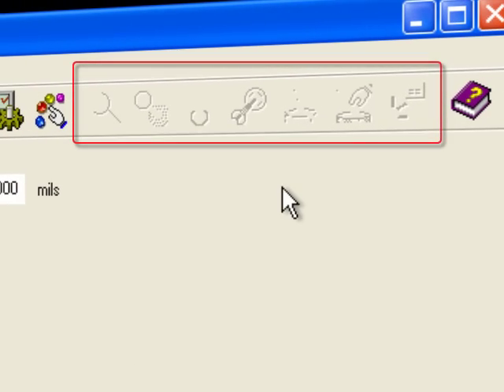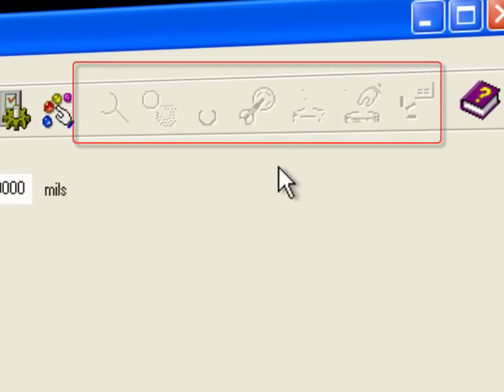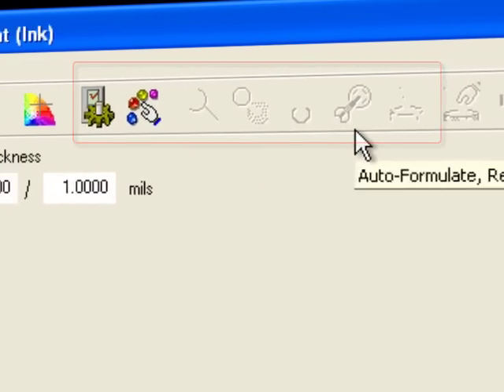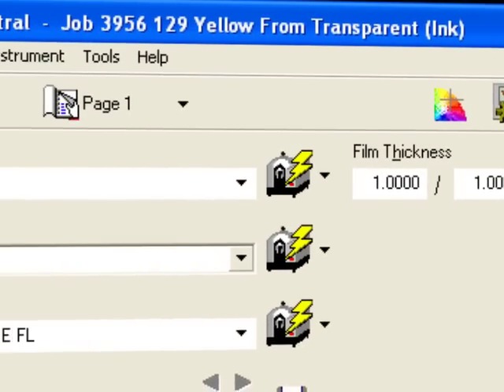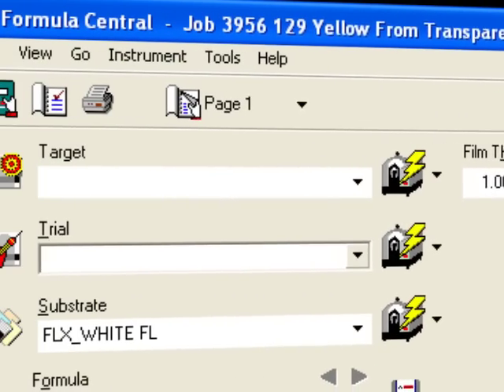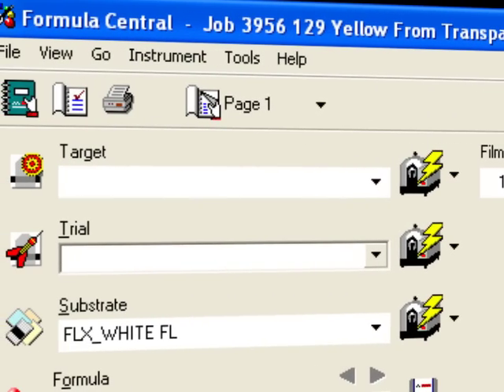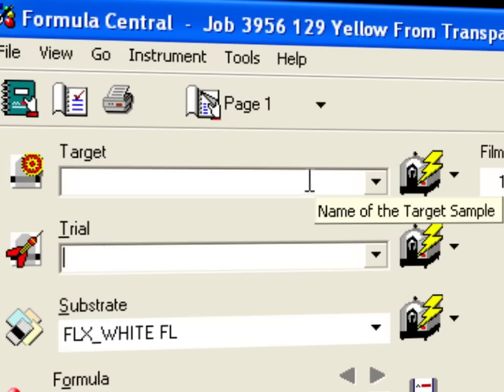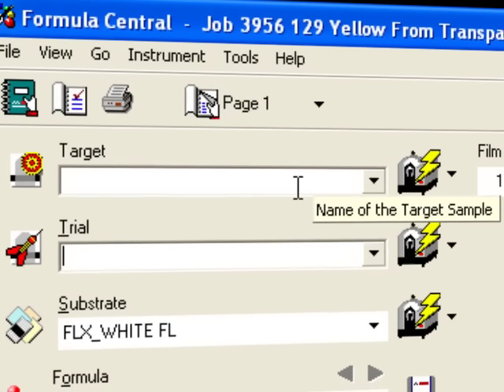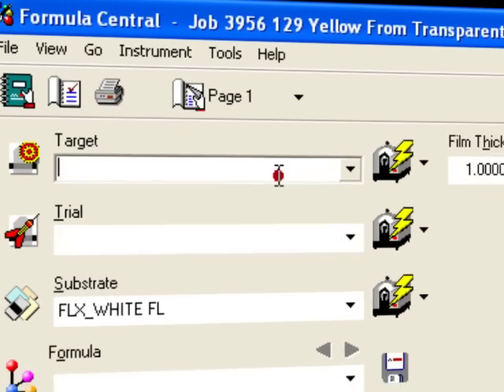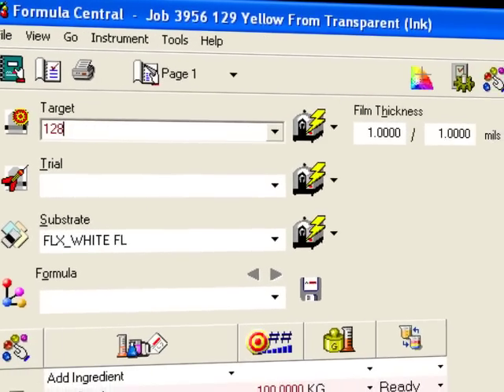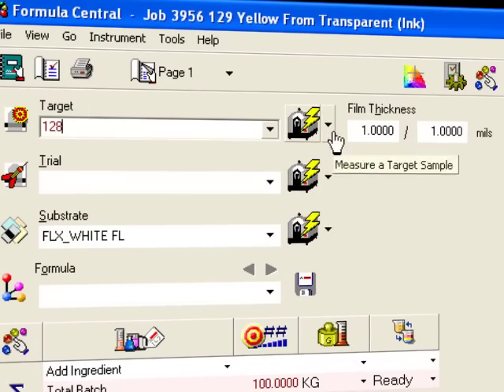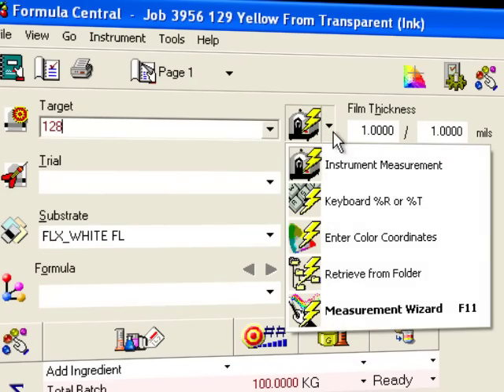Notice the match and correct toolbar buttons are disabled. The program knows we're missing some important information. We need a target. What color should we match? Type a name for the target and use the measurement button or the drop-down to find a stored measurement.